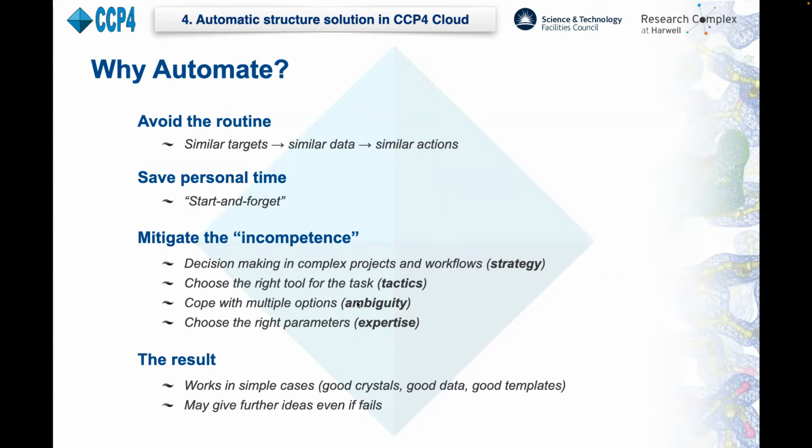Automation helps with choosing strategy and tactics in structure solution, resolving ambiguity, and it provides inbuilt expertise, which a user may not have. This is natural and nothing to be ashamed of. By analogy, these days, you do not need to be an electronic engineer to operate your laptop. And ideally, you wouldn't have to be a trained crystallographer to solve a structure. But unfortunately, it doesn't work exactly that way. We are working really hard to that end. And yet there is no ultimate automation in protein crystallography.